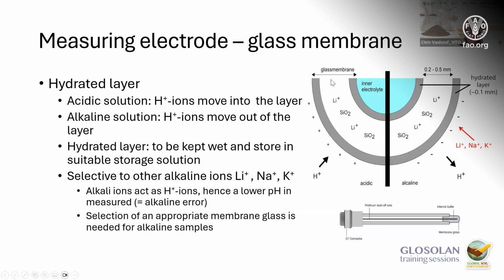It's important that this hydrated layer is kept wet, and therefore you have to store your pH electrode in a suitable storage solution. You also may not touch this glass membrane with a tissue or so to clean it, because you can then damage this glass membrane.